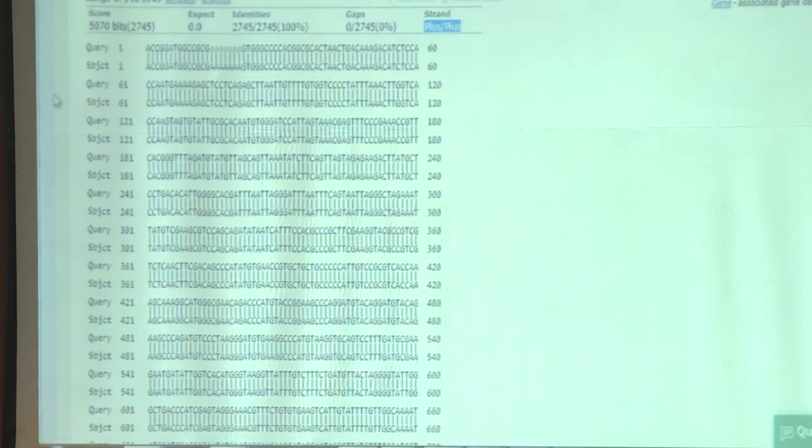And if some sequence is very erratic, you remove those sequences, because in GenBank people have deposited many bogus sequences. So if you are trying to find out, for example, in these 10 sequences, if someone is not starting from ACC, don't take that sequence because it will create problems for you. Only choose the proper sequences which will be useful for your analysis.